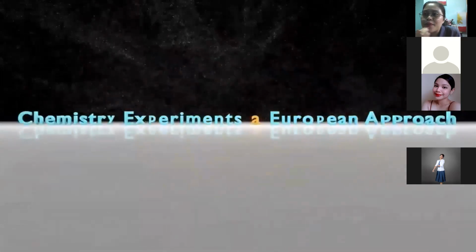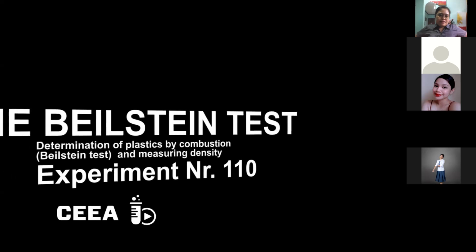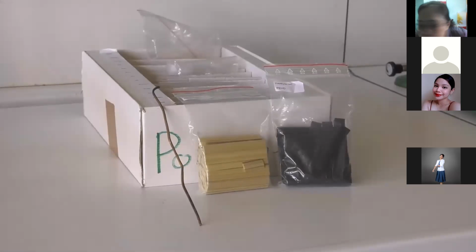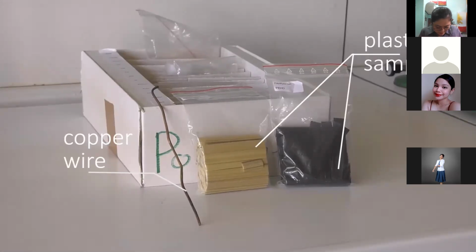So again, the halogens are fluorine, chlorine, bromine, and iodine. Please consider the guidelines concerning the waste disposal, which are shown at the end of the video. For the following experiments, we'll need methanol, sodium chloride, plastic samples, demineralized water, and a copper wire.